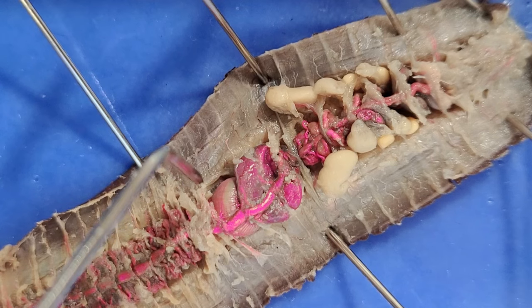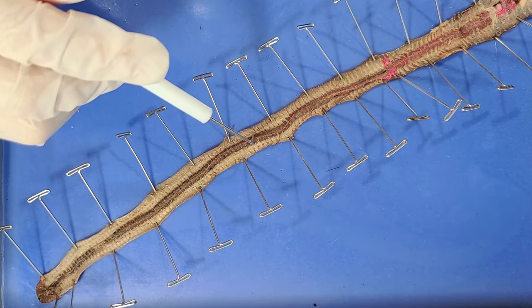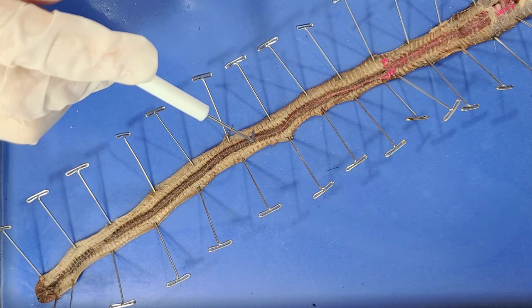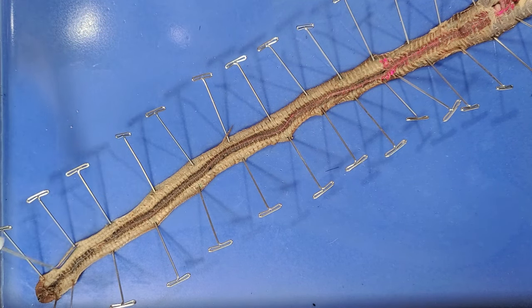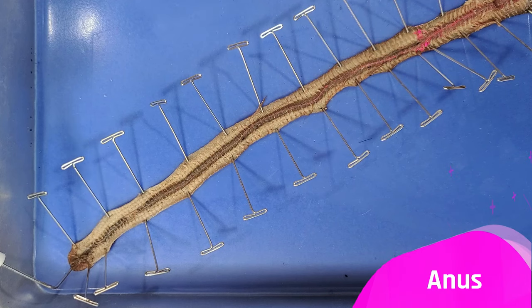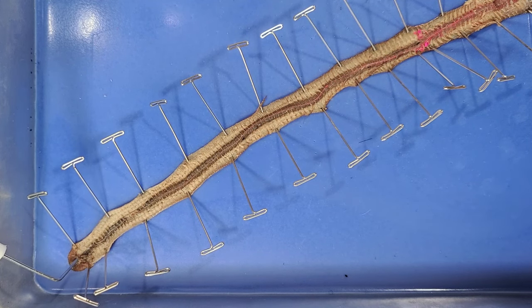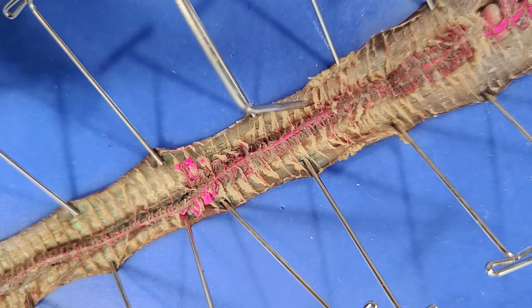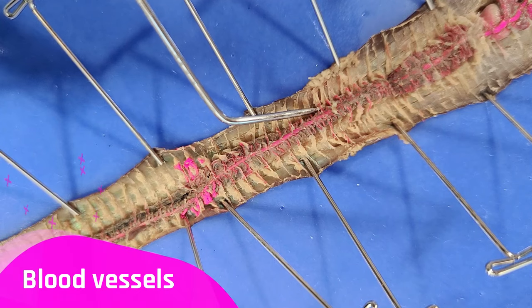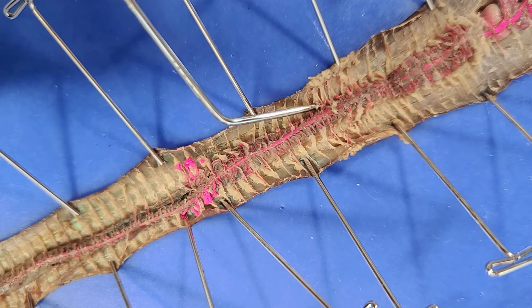Once the food leaves the gizzard, it enters this really long intestine. The intestine is where the nutrients from the food are absorbed, and it's really long to maximize surface area for absorption. At the end of the intestine is the anus, which is where waste is expelled. Earthworm droppings are rich in nitrogen and other nutrients beneficial for plant growth, making earthworms a great natural fertilizer. The intestine is also surrounded by tiny pink threads, which are blood vessels that distribute nutrients through the body of the worm.